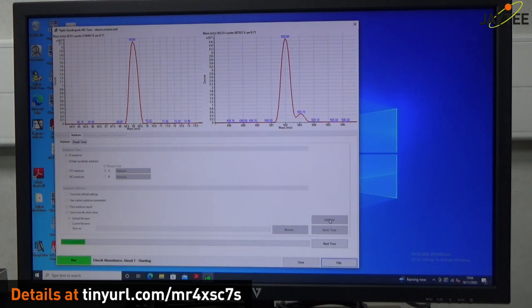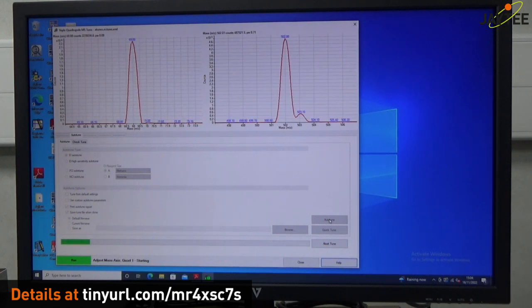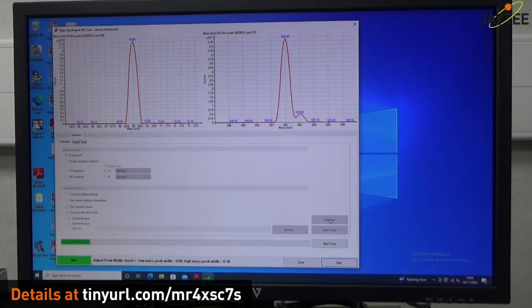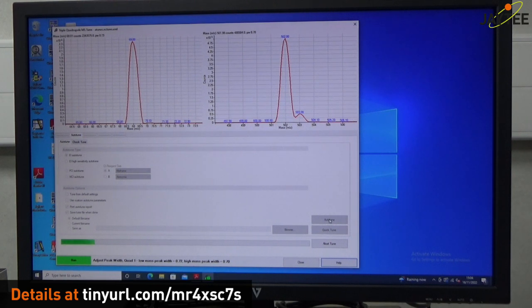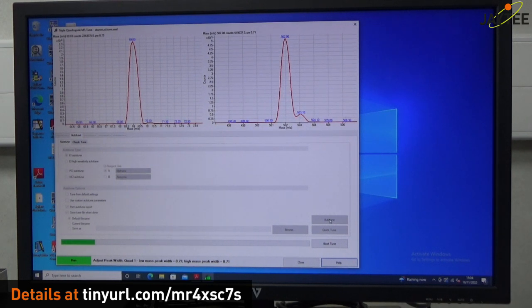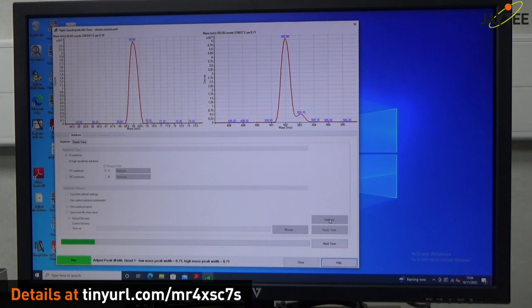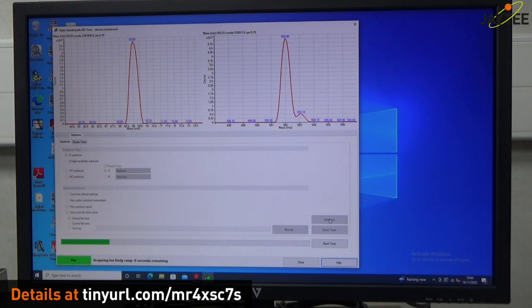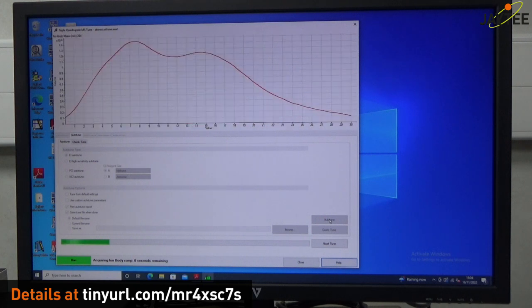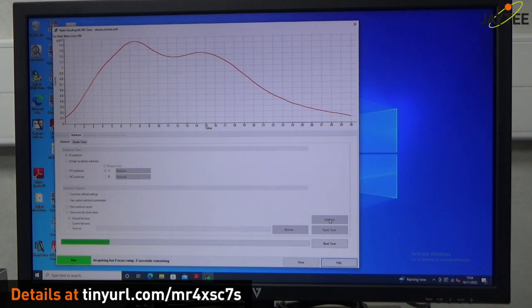And at the end you'll get a good print out, which I'll just start up. So you see plus two pictures, you see 69 and 502. 69 is CF3. And 502 is the whole molecule, minus CF3, CF2, CF3. And also see the isotopes at 502, 503. So it then goes through its routine.